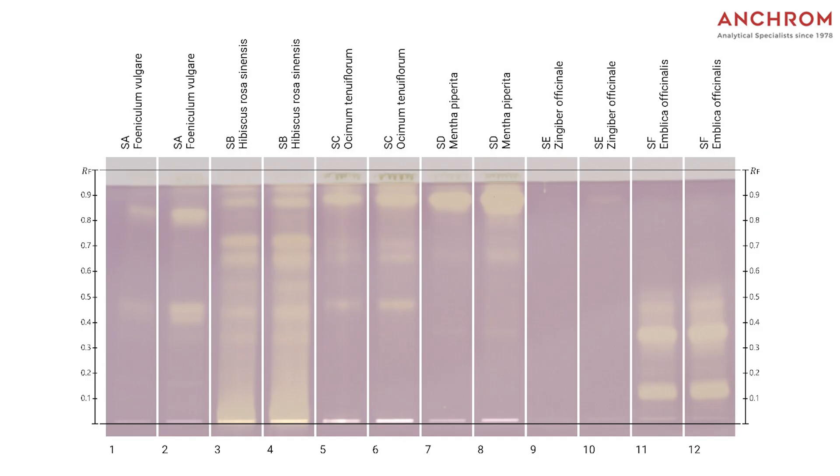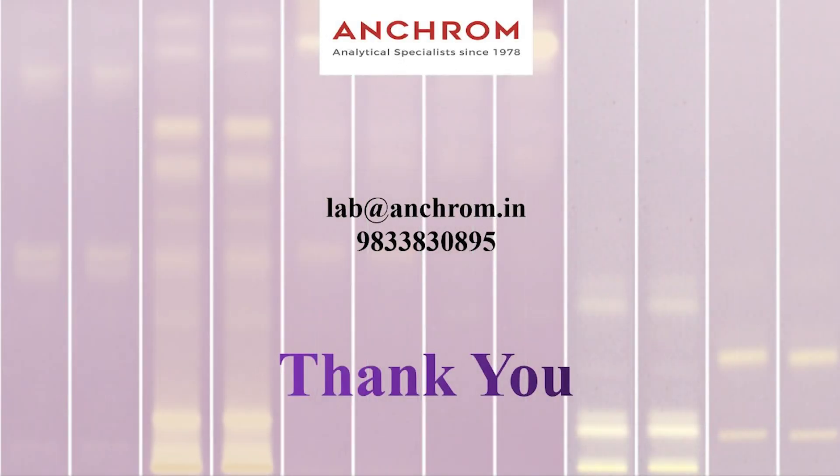After completion of the analysis, we will proceed for result interpretation. As you can see here, the derivatized plate image with DPPH reagent where yellow zones or bands had appeared against a violet background which indicates the presence of antioxidant compounds in all these samples.